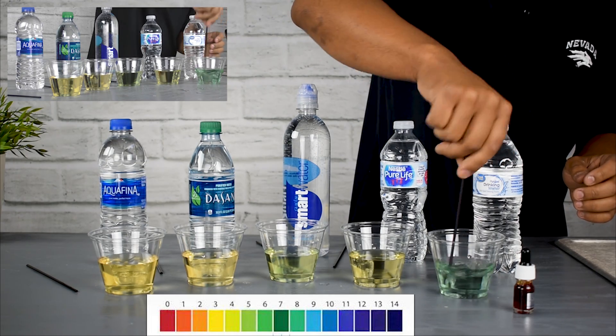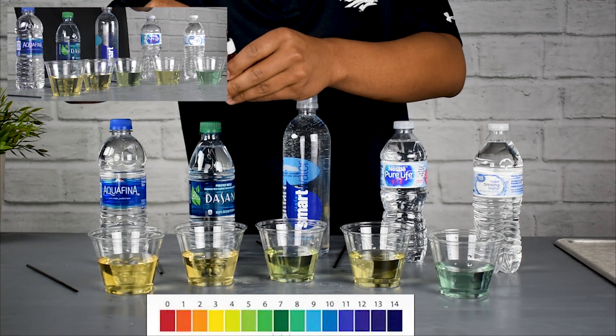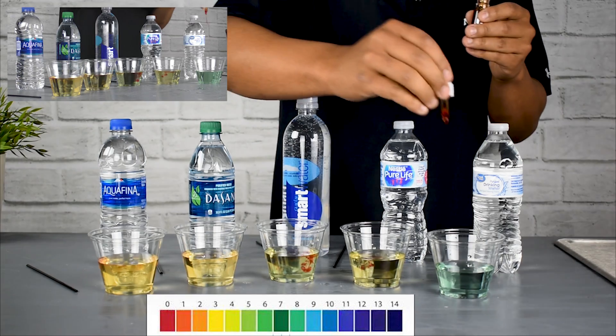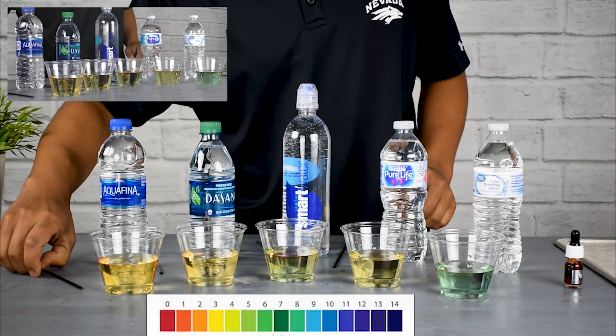The Great Value Walmart brand is pretty good — there's almost a little bit of blue-green in there, so it looks like almost an 8 to 8.5. Adding one more drop just to make those results a little more dramatic so you can see them more clearly.